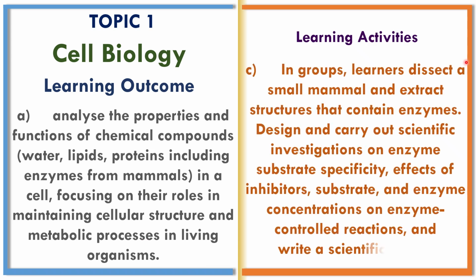Our learning activity is C. In groups, learners dissect a small mammal and extract structures that contain enzymes. Design and carry out scientific investigation on enzyme substrate specificity, effects of inhibitors, substrates, and enzyme concentration on enzyme-controlled reaction, and write a scientific report.